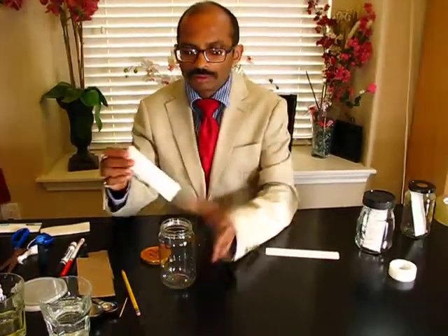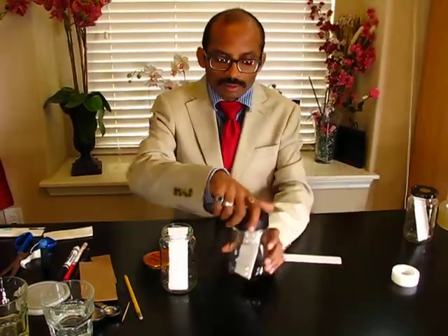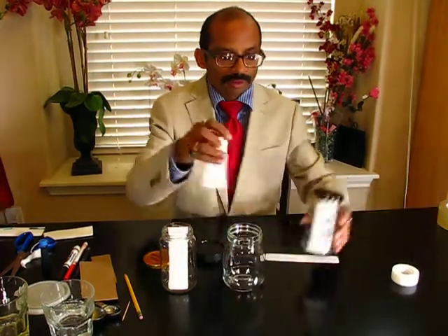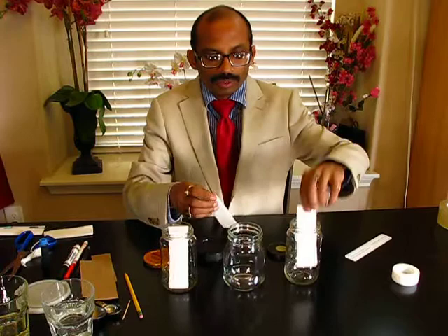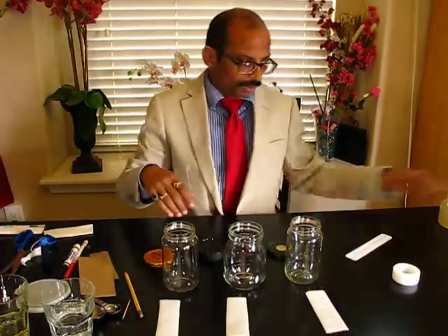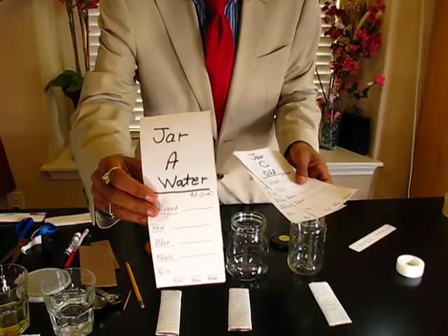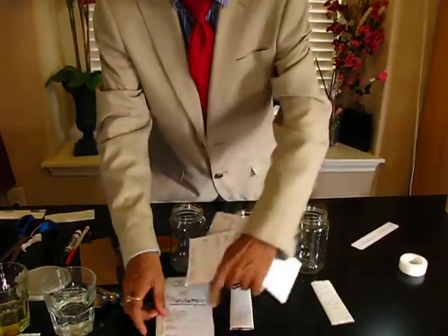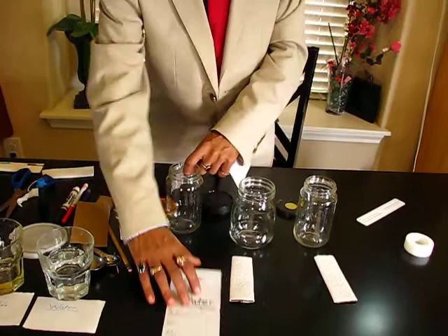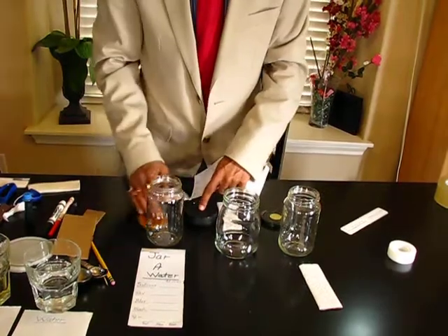I'm using three glass jar bottles, which are also available at home. If you don't have these bottles, you can make smaller TLC plates or use plastic containers. I have three plates ready, and I'm labeling the jars: jar A will contain only water.